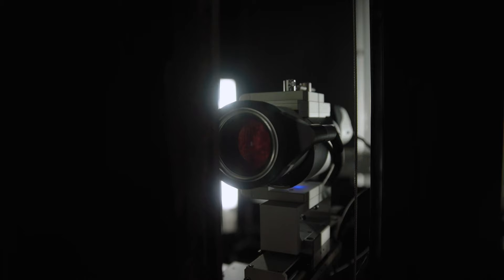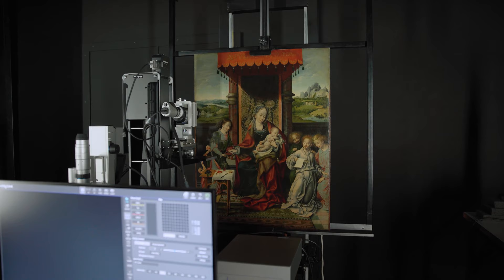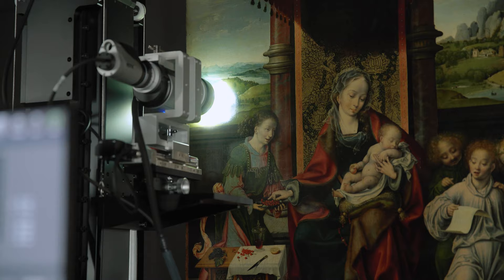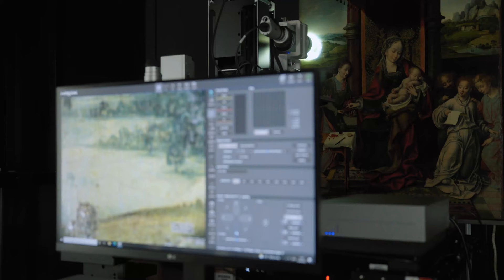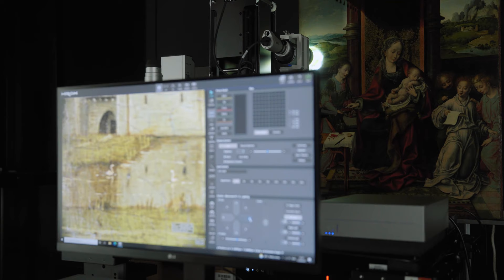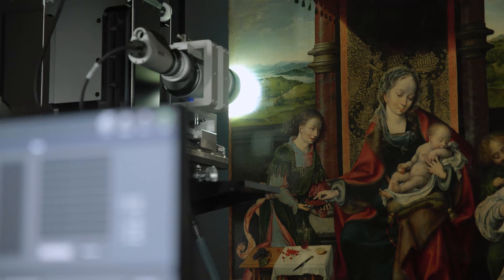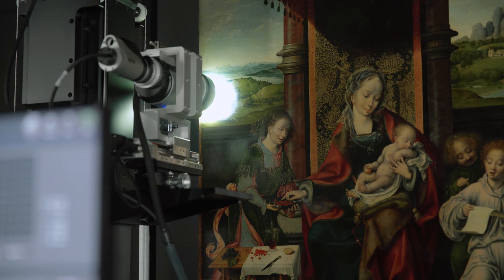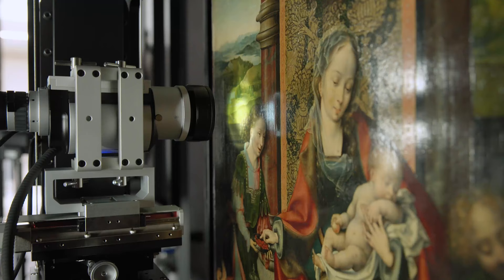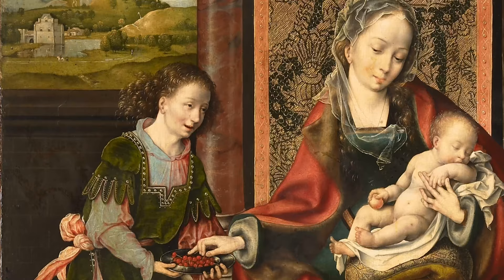Today we're looking at a painting by the Netherlandish artist Joos van Cleve from the early 16th century. This is extremely interesting in terms of technique because it's a very high quality Netherlandish painting on oak panel with an oil medium, and we've picked up lots of fine detail that you can see with the naked eye, but being able to examine that in much greater detail is extremely exciting. One of the most interesting features about many Netherlandish and early Italian paintings is that they often have the central figures in the middle and then in the background incredibly detailed scenes — such as people moving around small buildings, or as in this case someone on horseback — painted in very fine detail but incredibly small. The closer you go, the more you realize the skill the artist had to depict this.